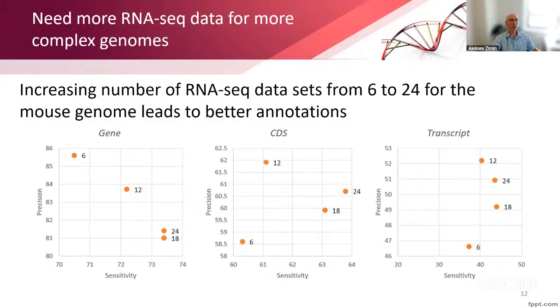The only way we can annotate UTRs is just to accept what transcript sequencing gives us, and then find the CDS in the transcript. If a transcript has captured the UTR region correctly, then we accept it.